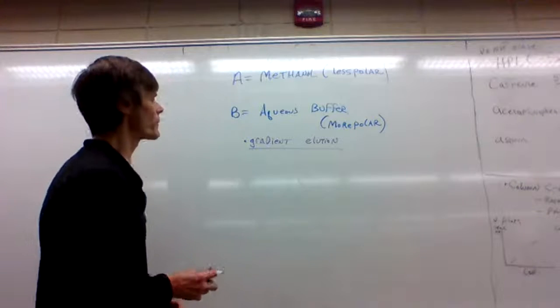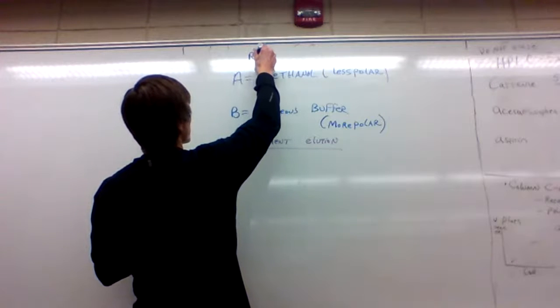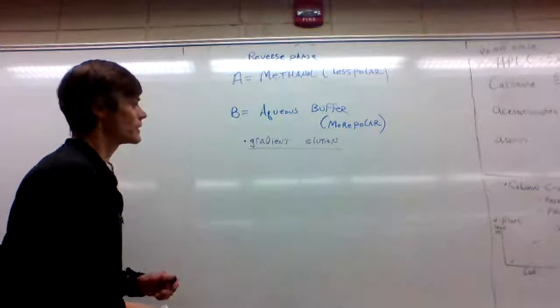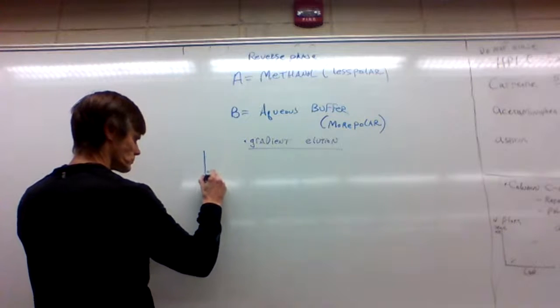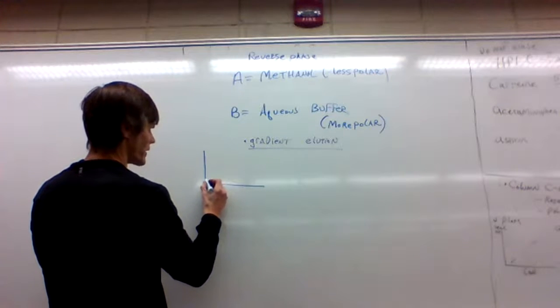Okay, let's think about a situation in which we're doing a reverse phase experiment. Reverse phase is we're going to use a non-polar column. And we're going to look at our chromatogram.